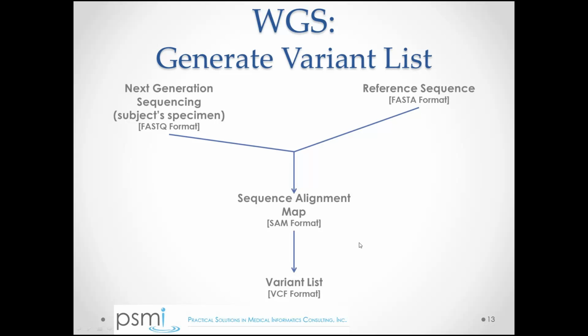And I think that people can naively think, oh, you did next generation sequencing, great. That means I have your 3 billion base pairs all neatly in a row. And I think walking through the technical aspects and the bioinformatics aspects, I hope, will give you at least a qualitative sense of, oh, there are some quality issues there. It might be that this pipeline leads to a list of variants, but how reliable is that particular list of variants?